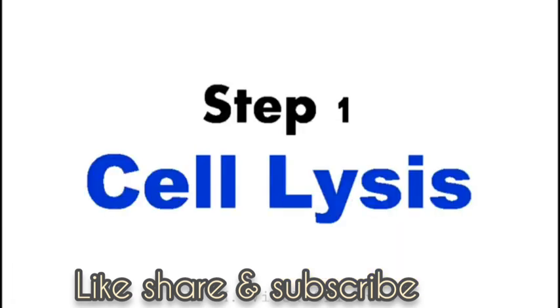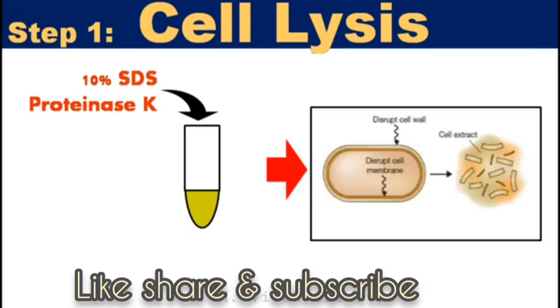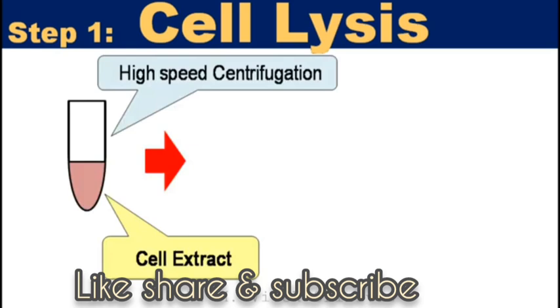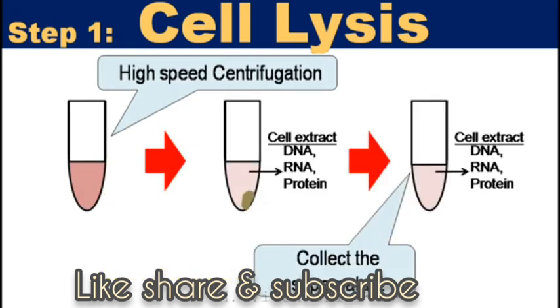The first step is cell lysis. 100 microliter of 10% SDS and 5 microliter of proteinase K is added to the resuspended sample. SDS is a detergent, used to break the cell membrane. Proteinase K enzyme is used to degrade the proteins in the disrupted cell extract. This mixture is mixed well, and incubated at 37 degrees Celsius in an incubator for 1 hour, for cell lysis. Following cell lysis, separate the cellular contents, that is cell extract, by centrifugation, to remove the cell debris.